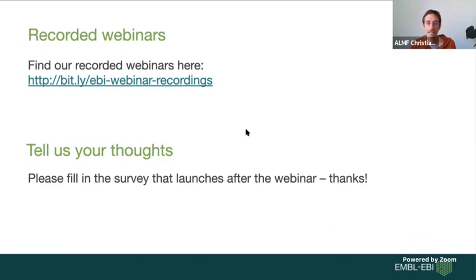Okay, then Rajini, sorry for the name. Hope it's okay. Which platform would you recommend to use for 3D image analysis? Very good question. So in Fiji, I mean, Python programming for sure. In Fiji, for teaching now, we always use, or a lot, a plugin called MorphoLibJ or the 3D image suite. So there are 2 very good Fiji plugins for 3D analysis.